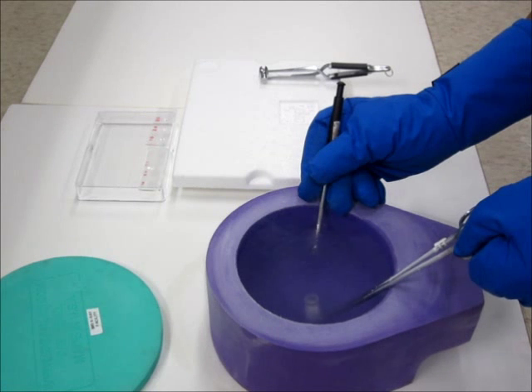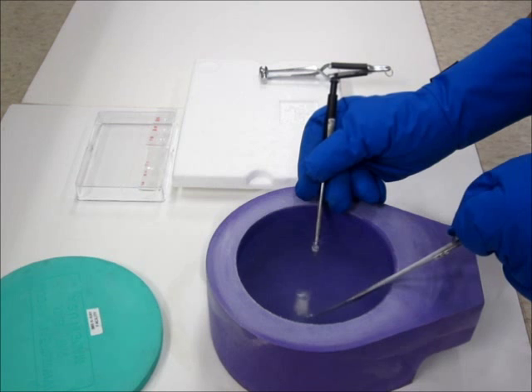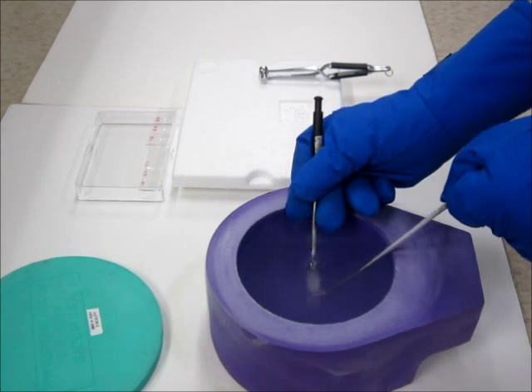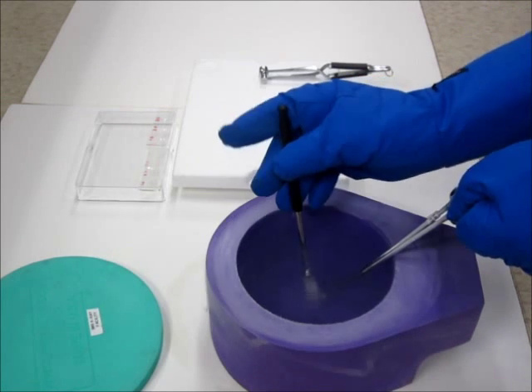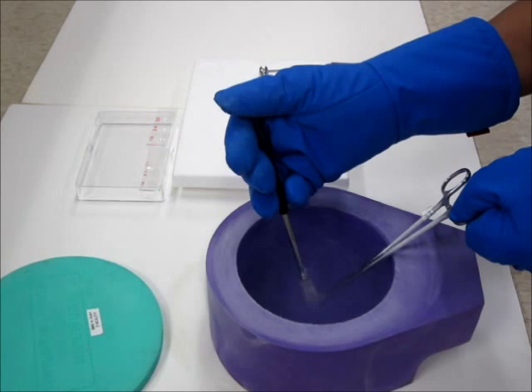Now I am aligning the cryo vial so that the loop can be placed inside using the crystal wand. I am using the crystal cap pusher to place it inside.